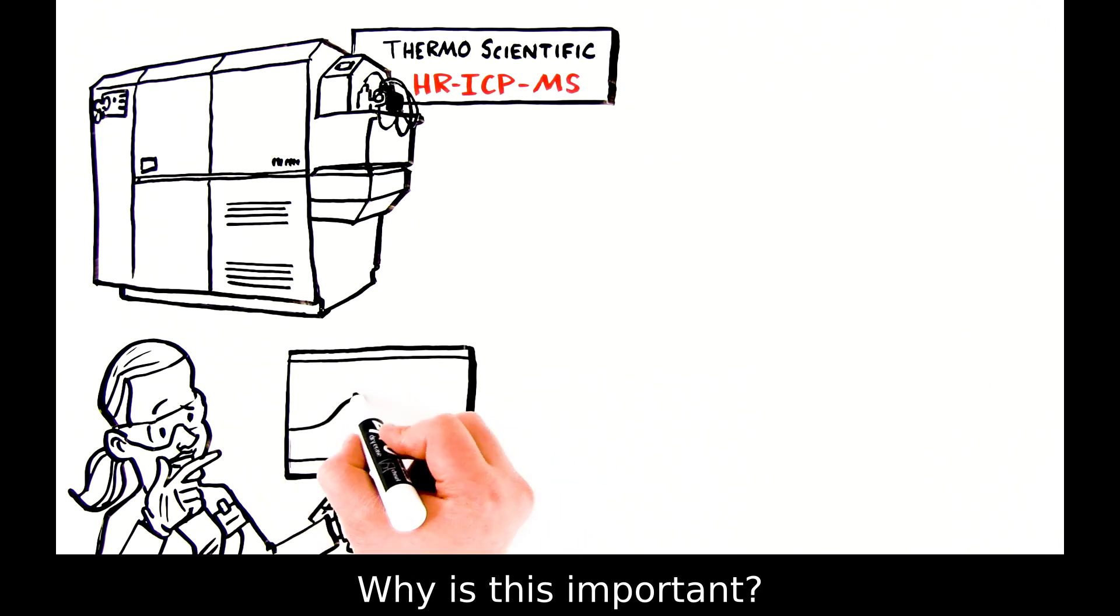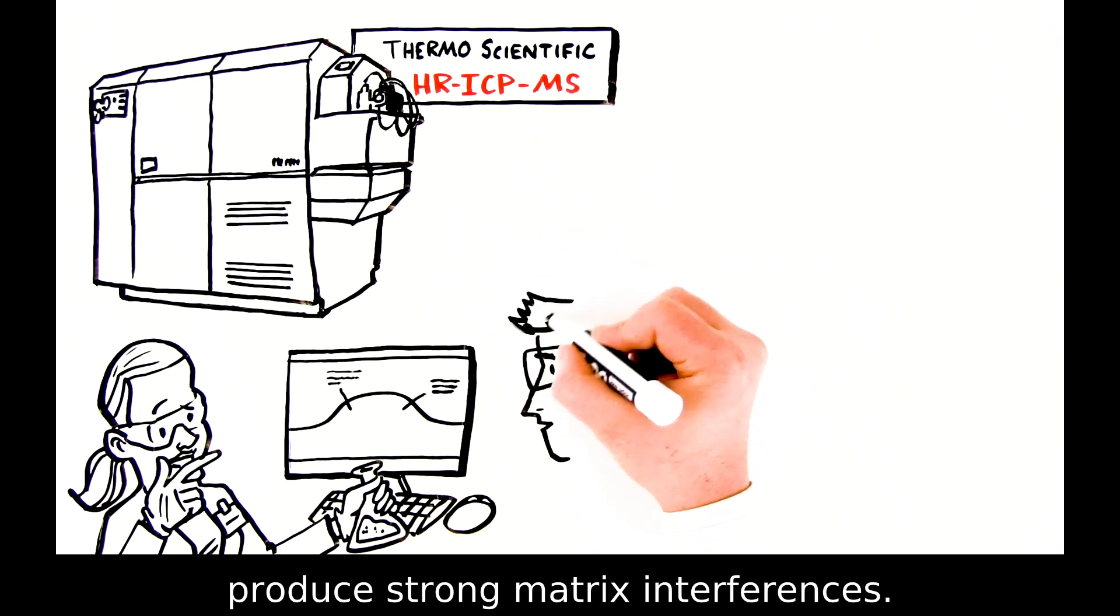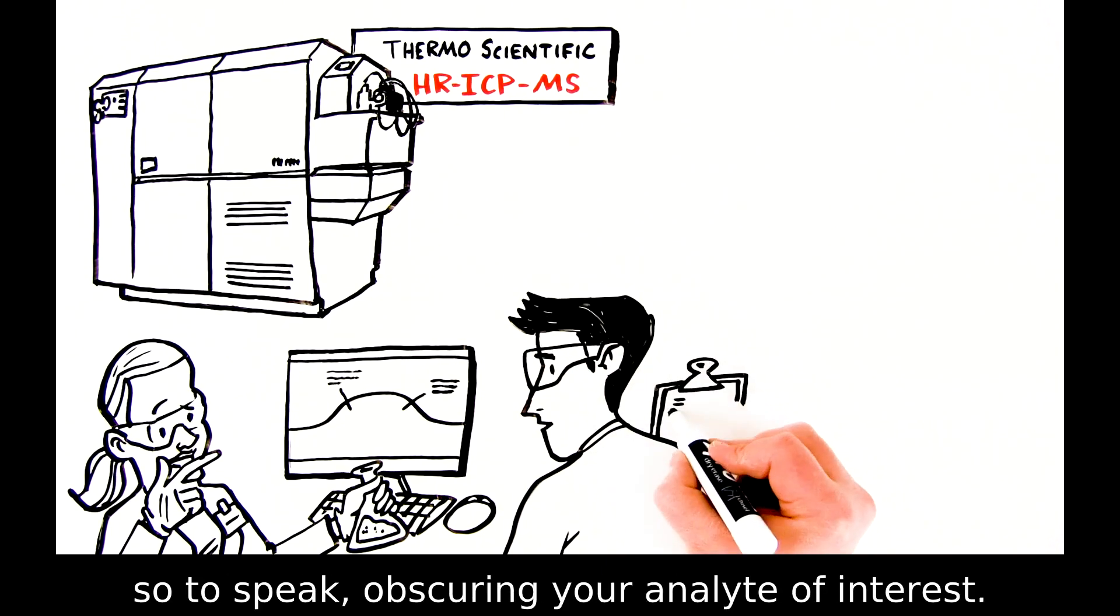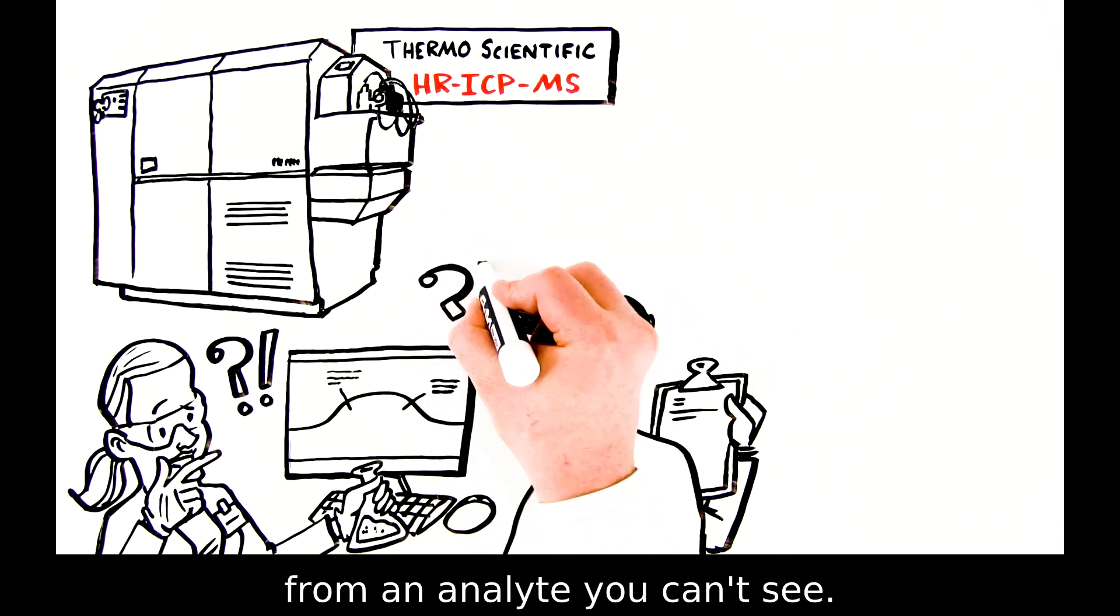Why is this important? Sometimes, samples at trace level produce strong matrix interferences. These interferences muddy the water, so to speak, obscuring your analyte of interest, and you can't learn anything from an analyte you can't see.